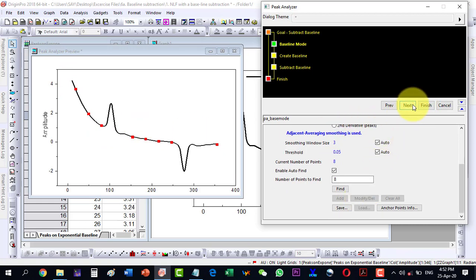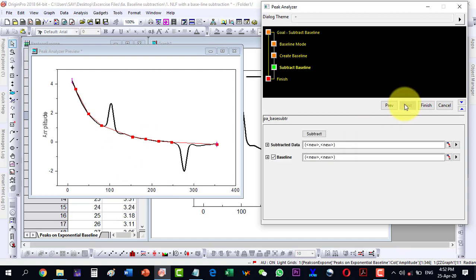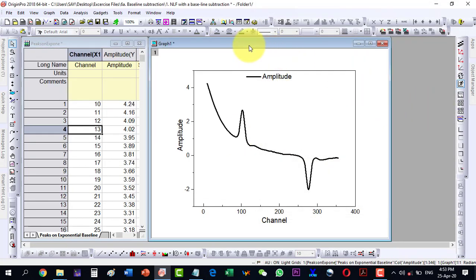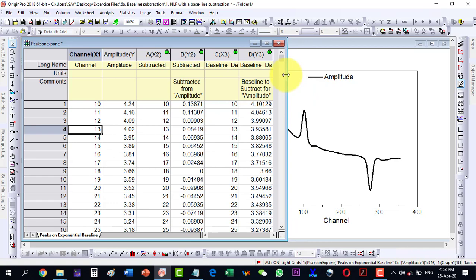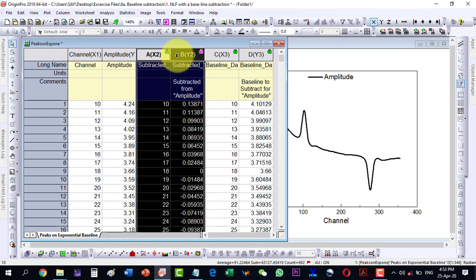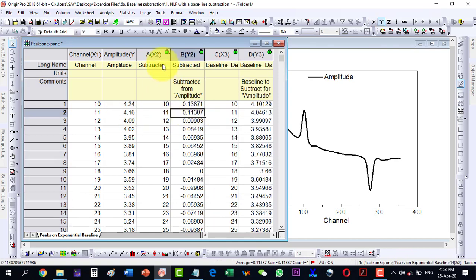If satisfied with the found points, click Next and the baseline is created. Modifications can be made as before. Click Next again to see the preview of how the data will look — it looks good. Click Finish. In the data sheet, no extra calculation is required; the corrected column is generated automatically.